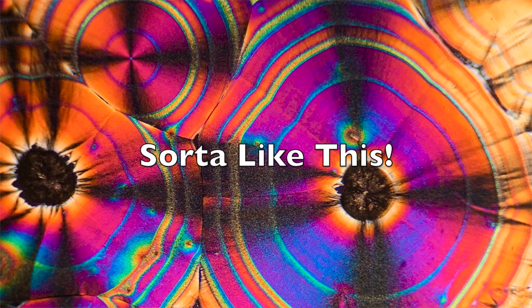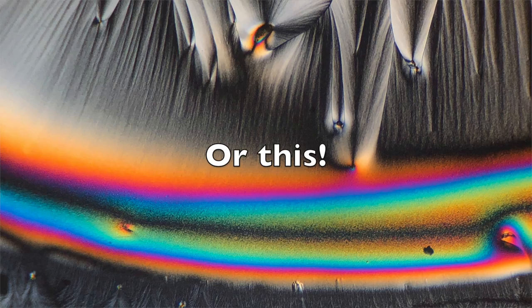Today we're going to be creating some art through polarized light microscopy. Now my microscope is just a regular microscope — it's not a polarized light microscope. So I have to use this special filter paper which polarizes or bends the light in order to get the desired effect that we're going to be looking at.